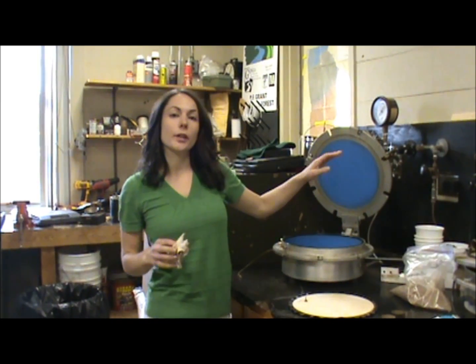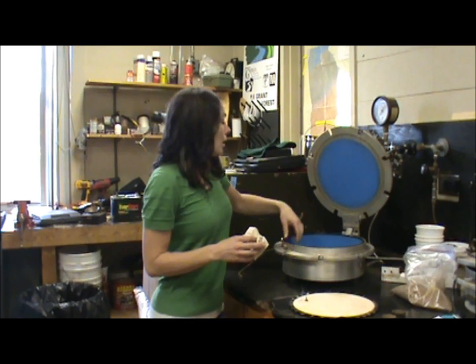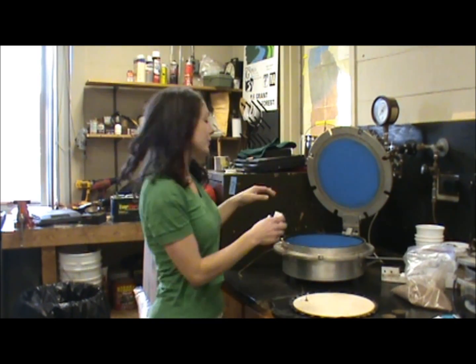For the second part of lab two, we're going to test the wilting point pressure, which is 15 bars. To do that, instead of using the tempi cells, we're going to use a pressure plate extractor.